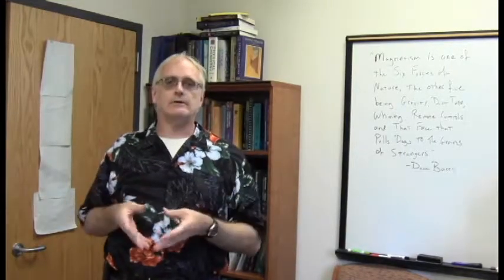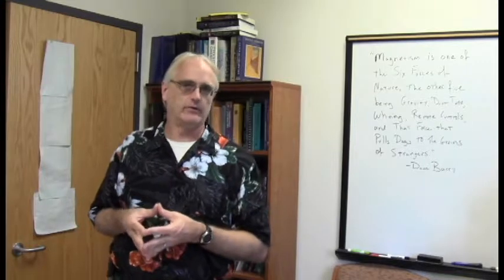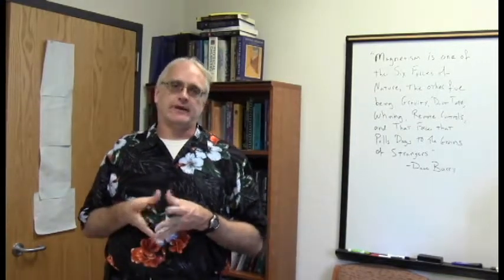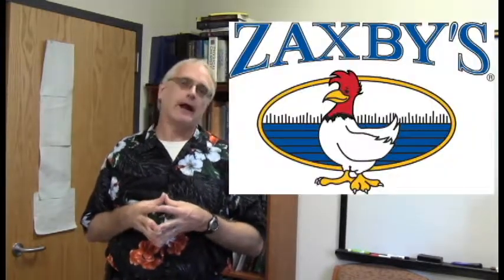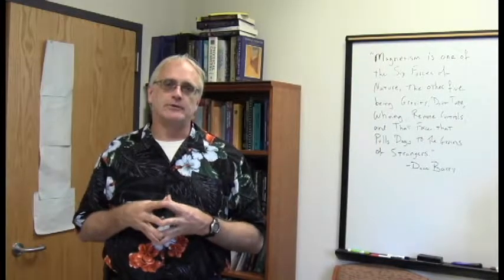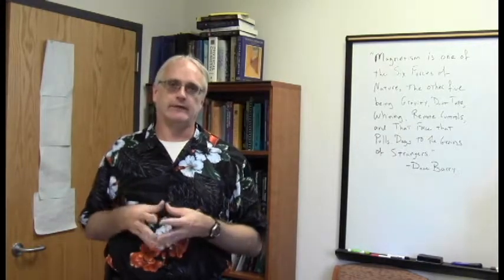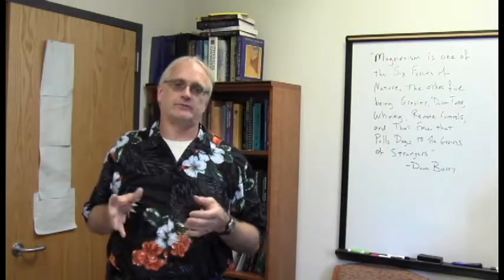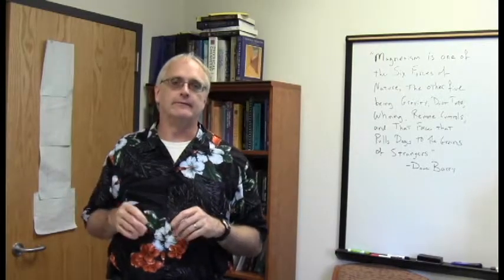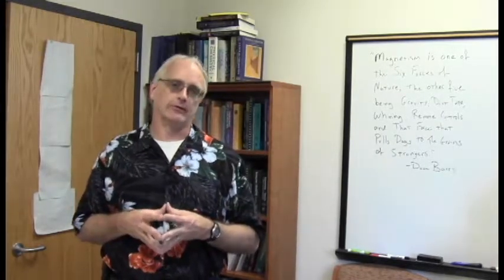Now, what we're going to do is carry out a crude demonstration of that process using a classic Stone Age FM radio. This dates back from the era when tablets were made out of stone and Zaxby's sold pterodactyl wings, but it comes from things I've done in my past. When we're doing this demonstration, I'm essentially just turning on a radio and making a mark representing the strength of the signals that I'm measuring. Anytime you see what seems to resemble some schmuck's hands drawing the line or turning the radio dial, just remember that's an artifact of the experimental method, and you can safely ignore that. So here goes.